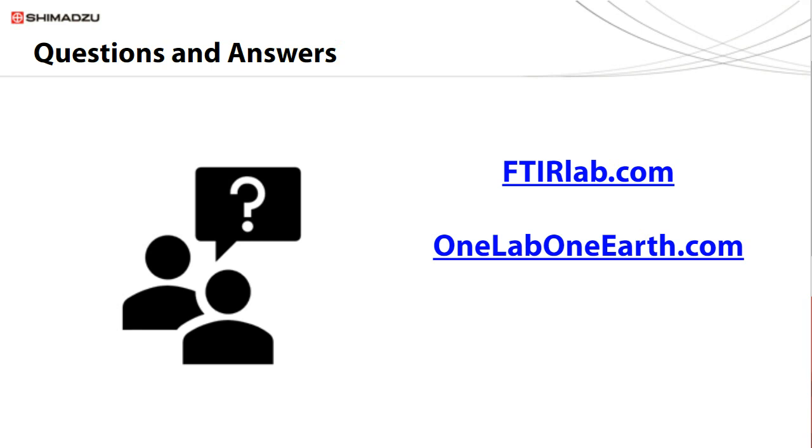Thank you for the question. As you know, identification using infrared is dependent upon how well our unknown samples match with the species already in the library. As we all know, most libraries out there have spectra of pure or clean species. In other words, all run under ideal conditions. If a new particle or naturally weathered particles are being measured, in most cases the spectral match will not be as good or will be incorrect.